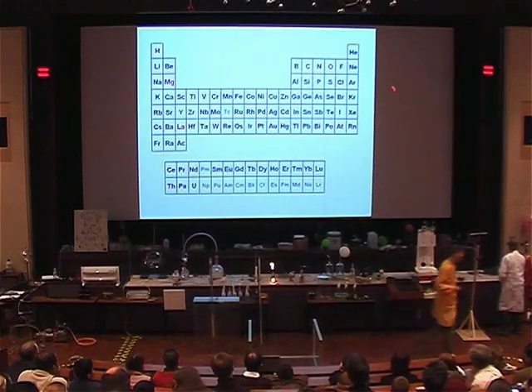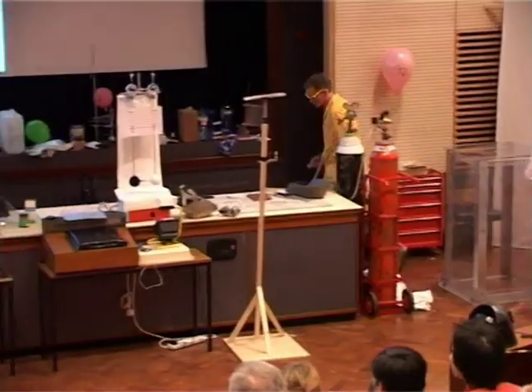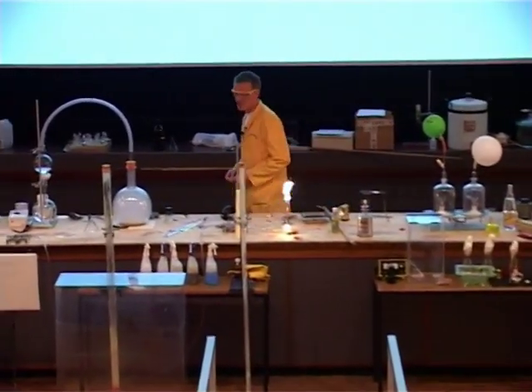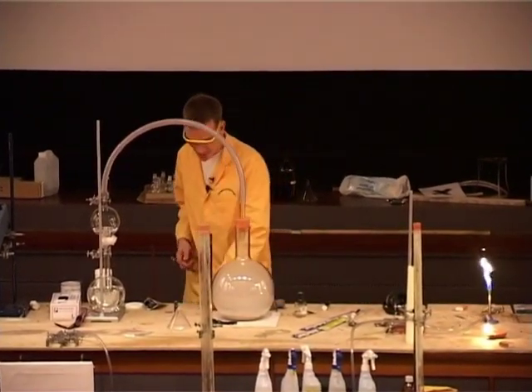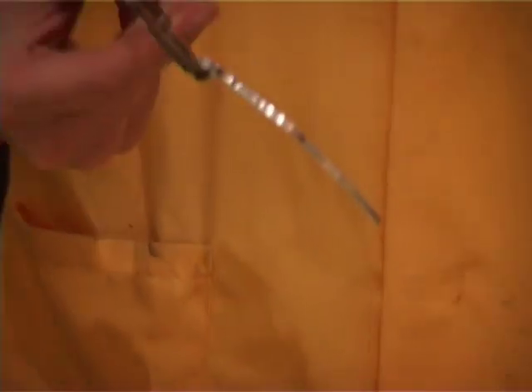Well, that seems rather inconvenient. We wouldn't really want to take one of those along every time we wanted to take a picture of somebody. So obviously people were looking for other ways to light up for their photographs. Now, one way we can do this is by burning certain metals, and a very good metal to burn here is magnesium.